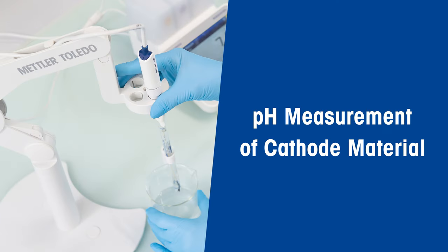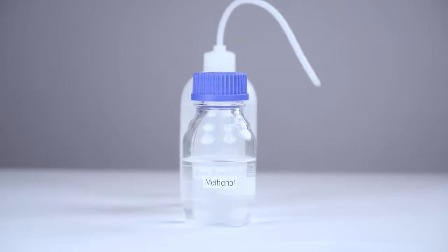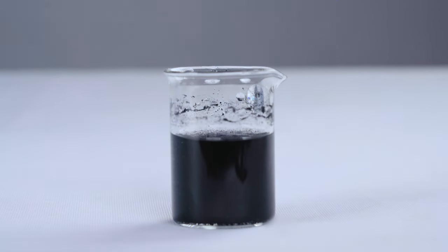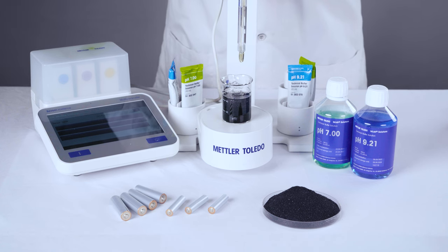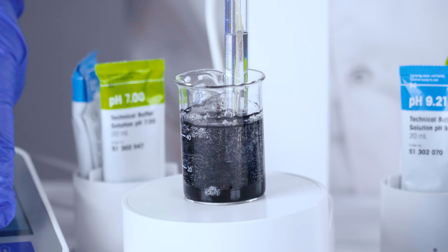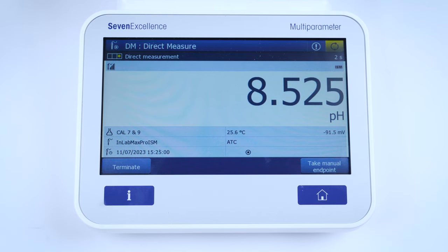Now you're ready to measure the pH of cathode material. Take 2.5 grams of carbon black and cathode active material and mix them separately with water and methanol in beakers. For cathode slurry, disperse lithium cobalt oxide with conducting additive carbon black and binder polyvinylidene fluoride in N-methylpyrrolidone solvent. Just dip your InLab Max Pro ISM sensor in the sample beakers, making sure the sensor junction is totally submerged. If your protocol calls for it, you can also stir the sample. Just remember to record the pH and sample temperature.